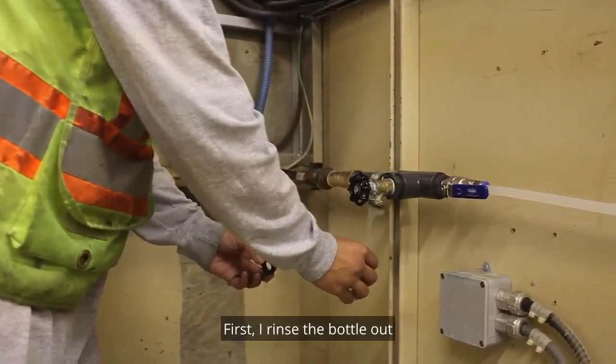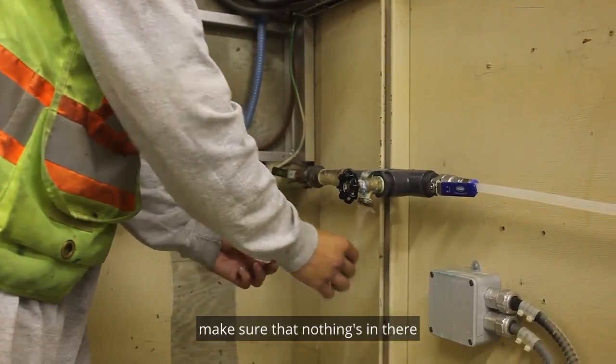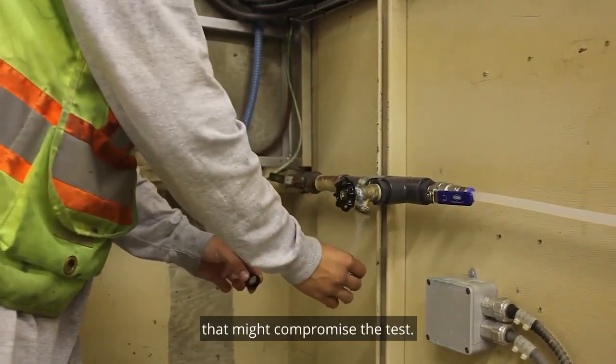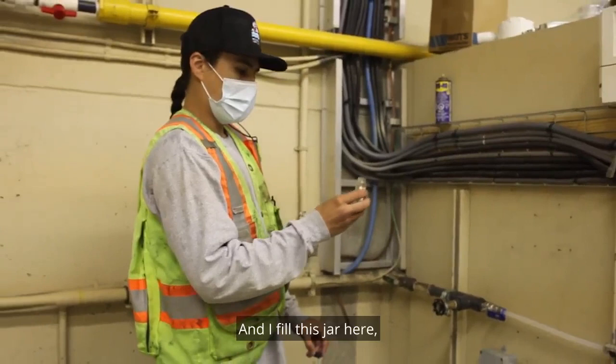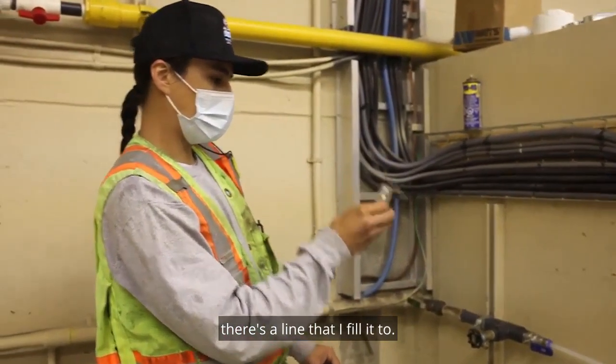First I rinse the bottle out and the cap out a few times, making sure that nothing's in there that might compromise the test. And I fill this jar here — there's a line that I fill it to.